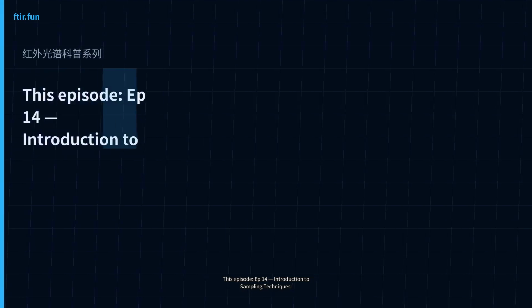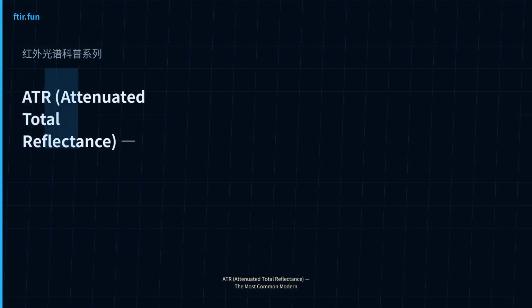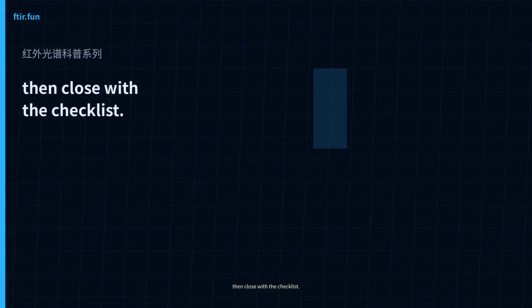This episode, Ep14, Introduction to Sampling Techniques. A. Attenuated total reflectance, the most common modern method. Then close with a checklist.